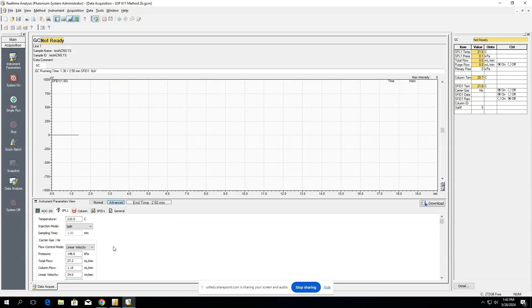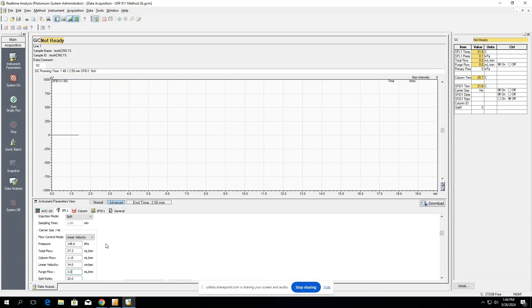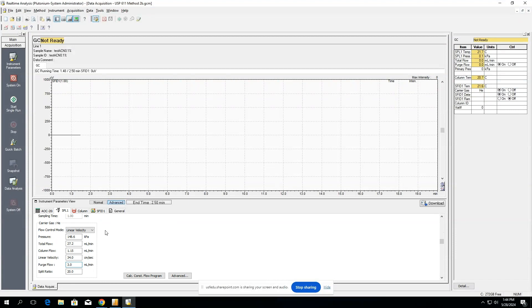If you're designing your own method, this is where you're going to modify these parameters and test injection until you have desired outcomes.